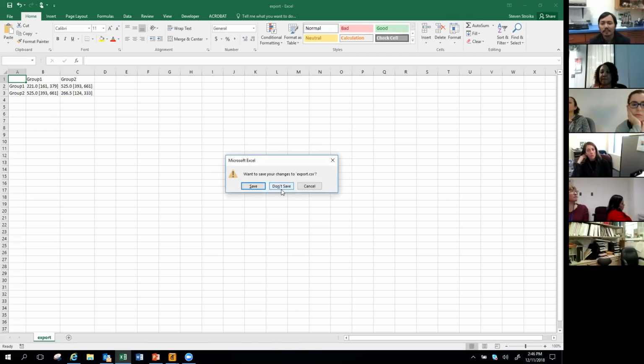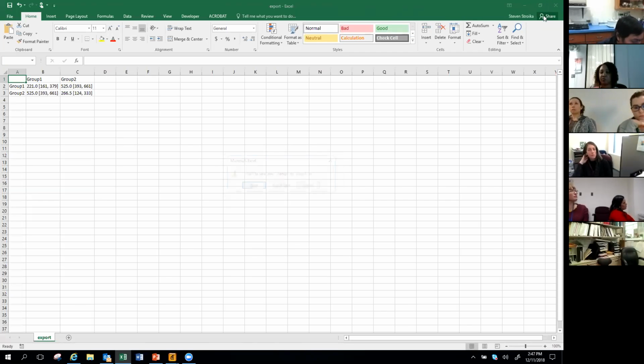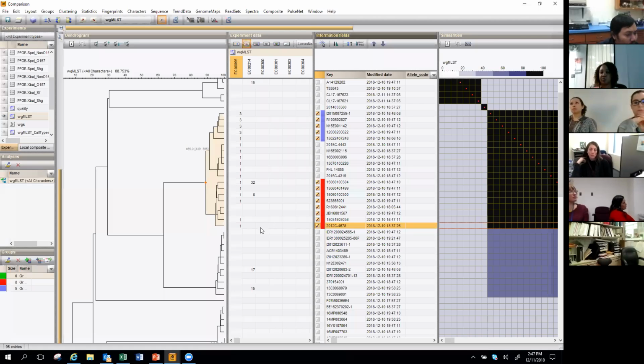We do a lot of this with HQ SNP trees, where you have different groups that fall at different places of the tree, and some groups that fall at the top of the tree are not actually that distantly related from groups that are down at the bottom of the tree, but the way the topology works, it just kind of moves them around in different ways. The same thing can happen here. So we were working with Applied Maths to find a way to compare those closely related groups to each other without having to just rely on the whole group together, but doing exactly what I just showed. So that's sort of a new feature that has just come into play here.